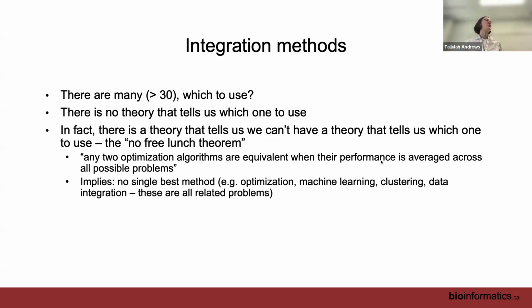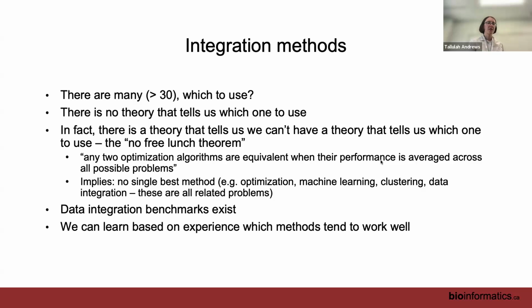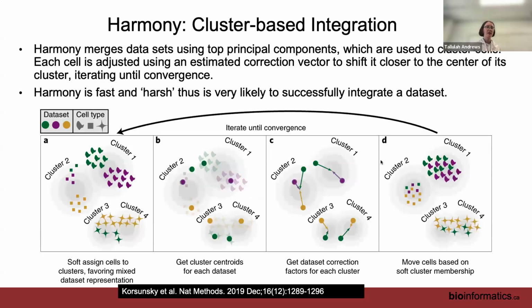So in most cases, people end up just trying a few until they find one that works for their data set and stick with that. There are data integration benchmarks that you can look at if you want some guidance on where to start or what method to use. We can also learn from experience, so you can come talk to someone like me or Gary who does this all the time and ask, which one do you think we should use? Because they've probably used all of them multiple times and know which ones are easy to run and tend to work well. So in answer to that, since I'm here already, the one that tends to work well and fast and is easy to use is Harmony.